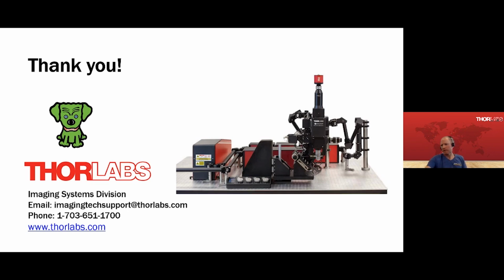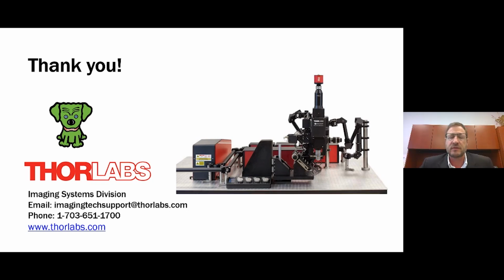Back to FLIM, what is the maximum number of photons that can be binned per pulse for FLIM measurements with the digital FLIM technique? And is there a limitation on photon flux for bright samples? Definitely there is a limit on photon flux because you really want to look at 1 photon per cycle. But in terms of binning, Eric, any?